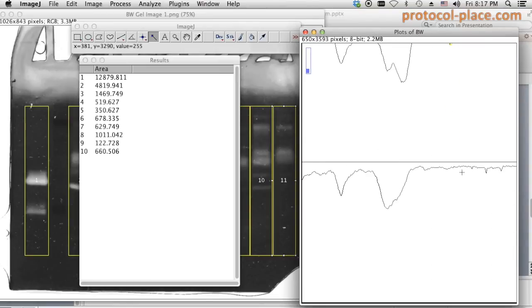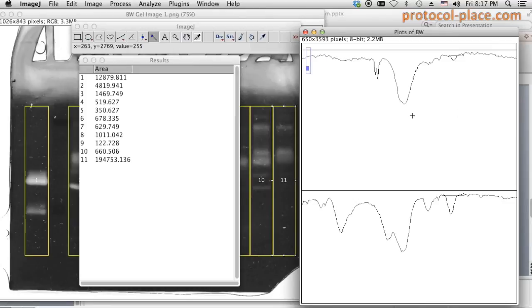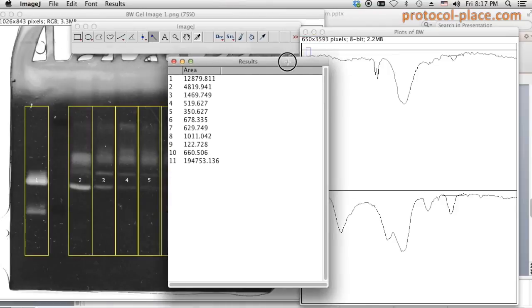Now, I've arrived to the last lane where I told you we couldn't really measure any MMP activity. As a reminder for myself, I usually just click in this open space, and when you get an absurdly large number of pixels, that's my cue to myself that this is a 0 measurement. And that's helpful if one of these middle lanes had 0 MMP activity. If you don't want to lose track of which lane had 0, just click on any empty space, and you'll remember that that absurdly large measurement is supposed to be just a 0. So you can use that as a way of keeping track, sort of as a placeholder for the future.